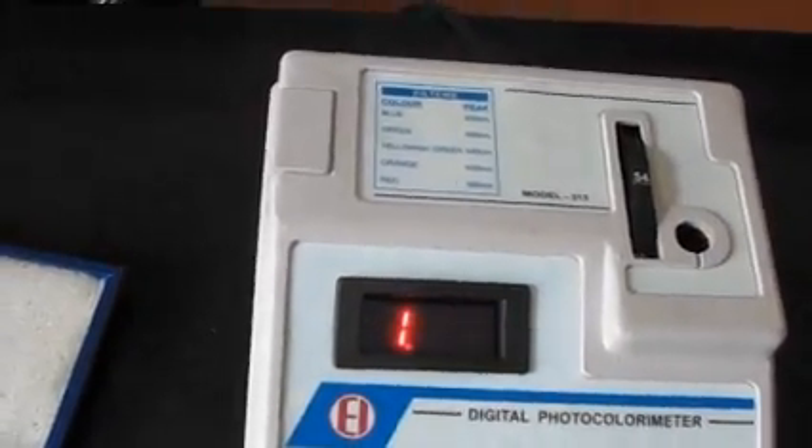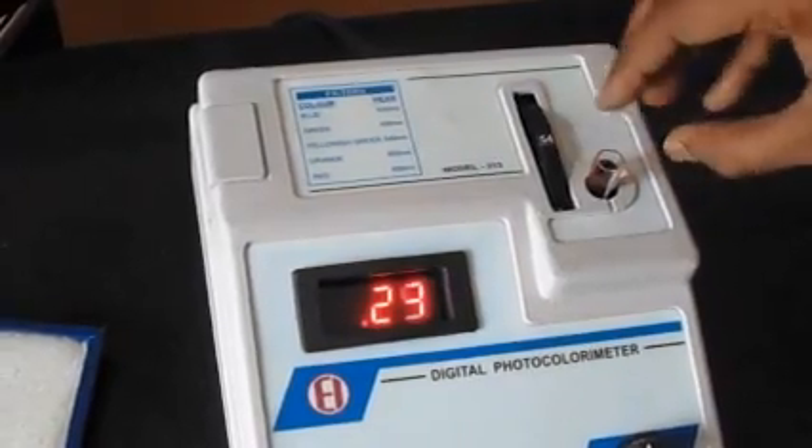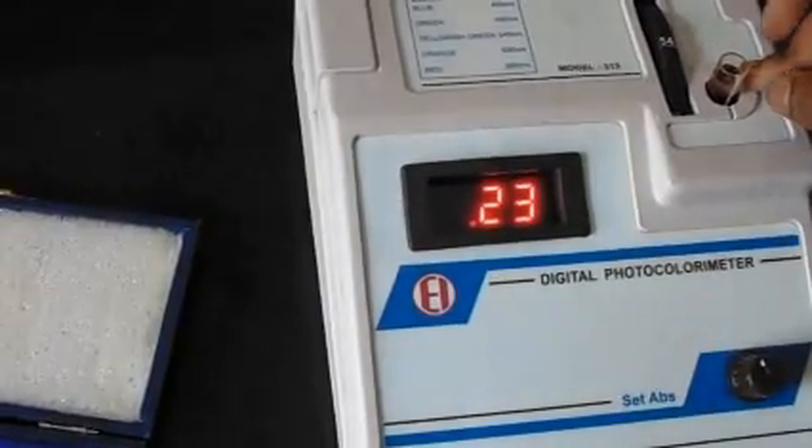Now check another sample. In this test tube we have a red solution — cobalt chloride. We will get the absorbance directly on the screen. This reads 0.23, meaning this solution has an absorbance of 0.23.